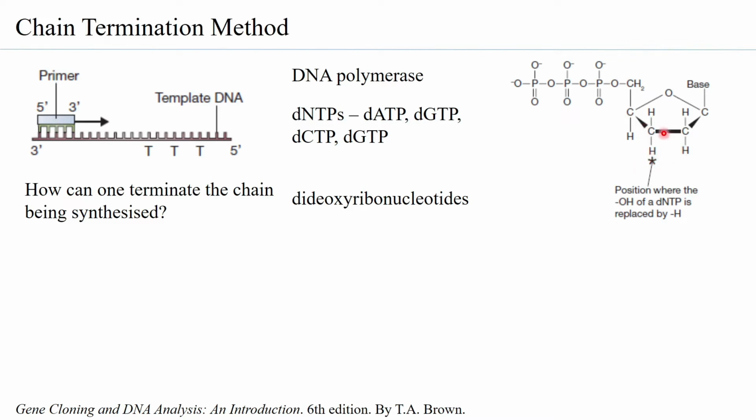And therefore, it is called dideoxy, because from both the carbons you have the oxygens removed. Now, effectively, what does it mean? It means that the DNA polymerase can incorporate this nucleotide, but because there is no 3' OH, it cannot further add any more nucleotides to this nucleotide. So ddNTP is therefore important.